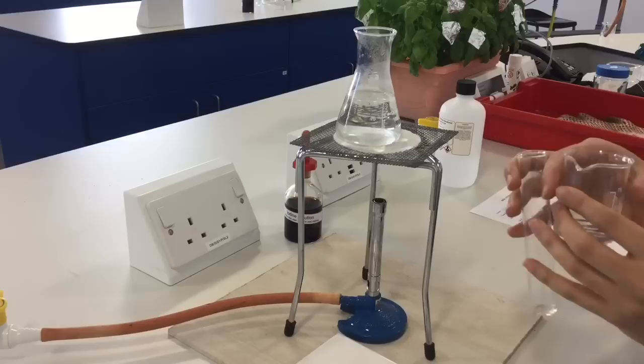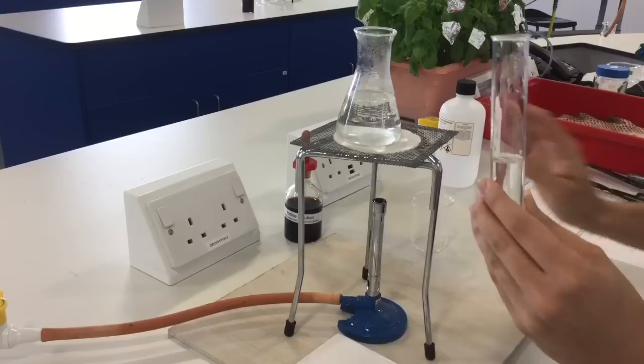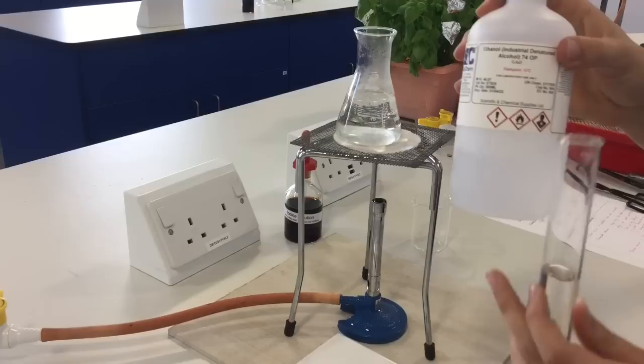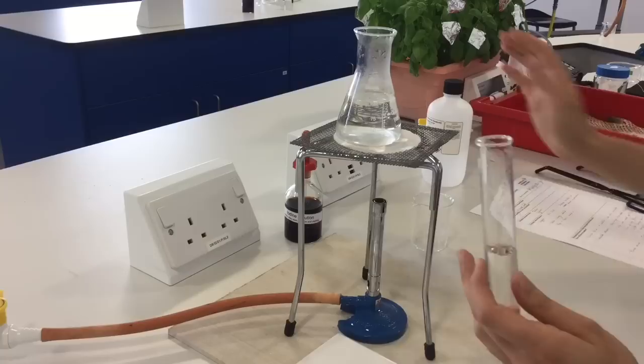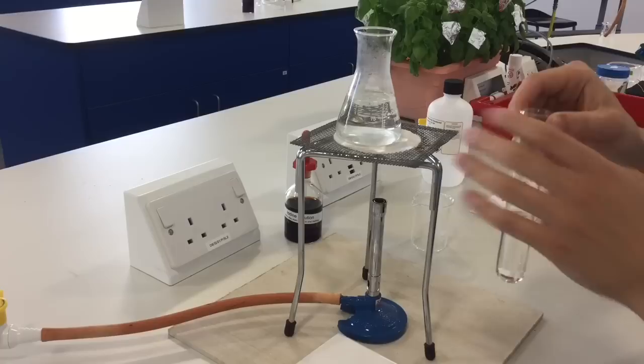Ethanol goes into our boiling tube. When we're doing this, we've got to be completely sure that no ethanol has dripped anywhere or gone on to the outside of anything, because as it says on the bottle, ethanol is highly flammable. Obviously working with a Bunsen burner, that could cause some problems. Just make sure there's no spillages anywhere.